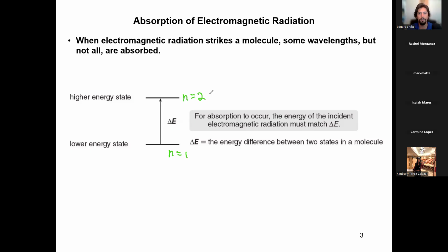What does IR measure? Well, the functional groups, but it also measures the vibrational motion of the molecules, because molecules can move left and right, in and out, up and down. They can rotate on their axis, and they can vibrate within themselves. So it's the vibrational motion that matches infrared light. And so when we shine a photon of energy that has infrared frequency at a molecule, the carbon-oxygen bond starts vibrating, or the carbon-hydrogen bond starts vibrating. And that is the energy states that we are measuring here.